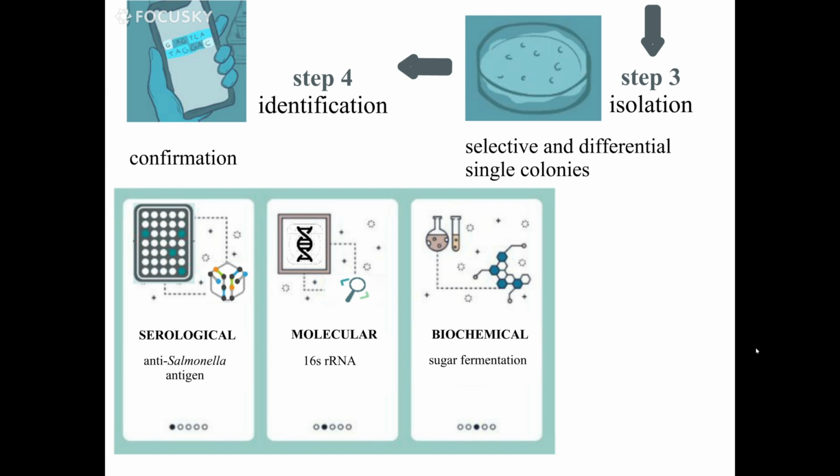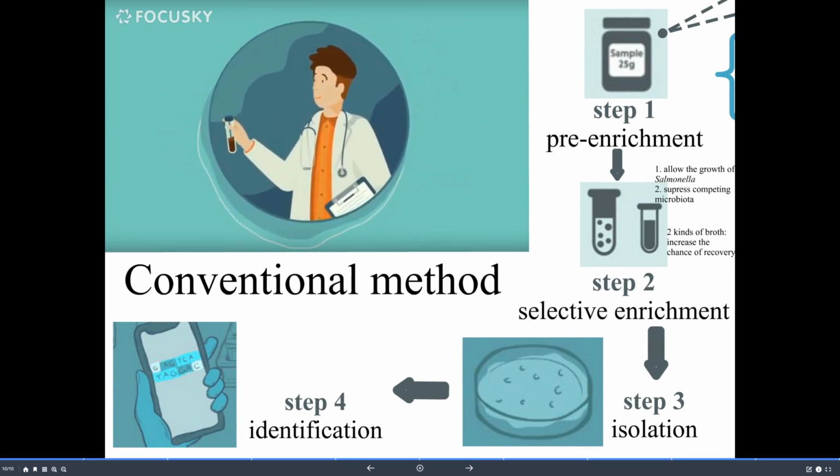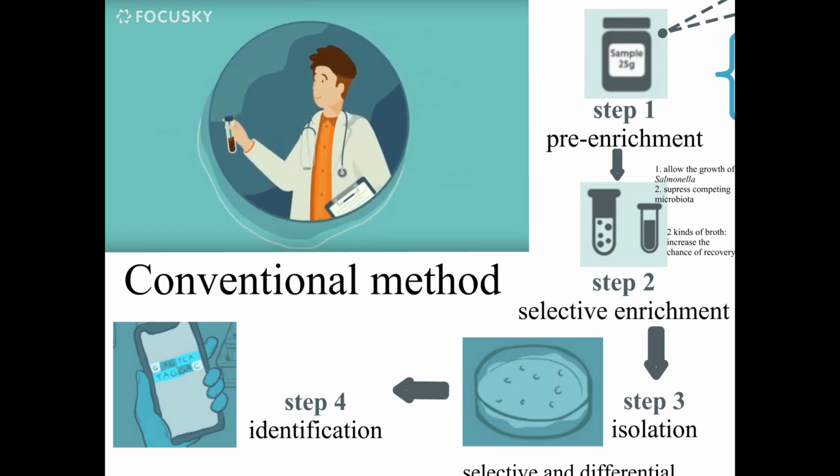such as sugar fermentation. Those 4 steps are not only used in Salmonella detection but also commonly used as a guidance to design the detection protocol for other pathogens.